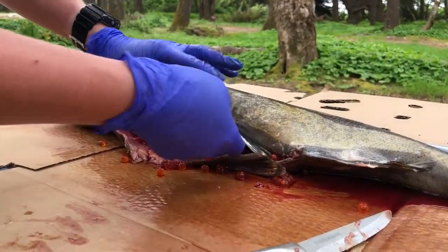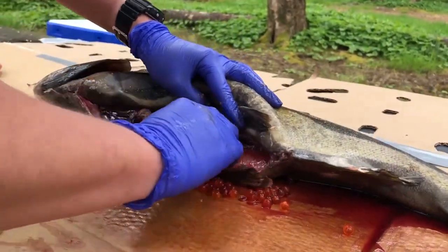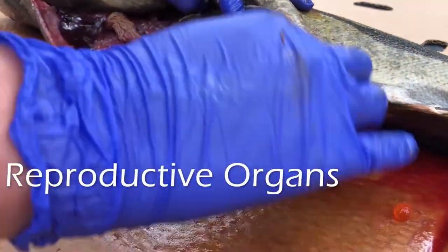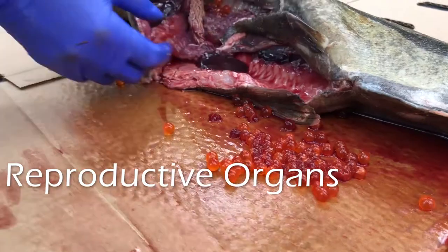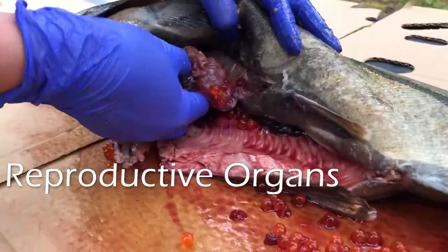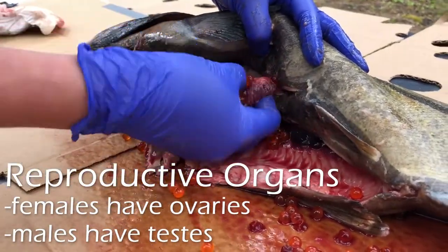I have cut open my fish, and right off the bat I can see that my fish is a female. We've got all these eggs that have spilled out of her, and we can see she's got these egg sacks right here. These are the ovaries in the female fish.